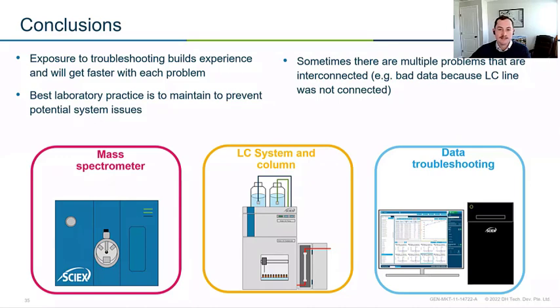Regardless, though, it's all about isolation. So isolate where the problem is. Is it a mass spec problem, computer problem, LC problem? Is it my environment? That's going to be really critical for getting to the bottom of your problem as quickly as possible.